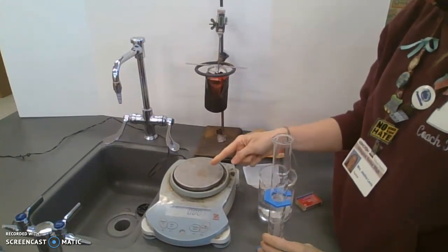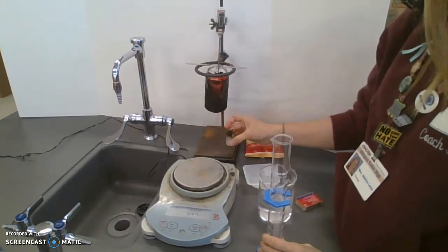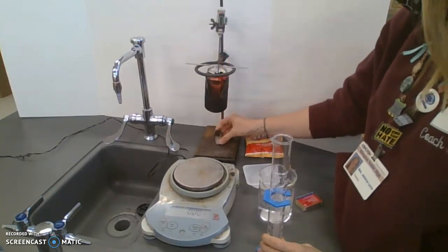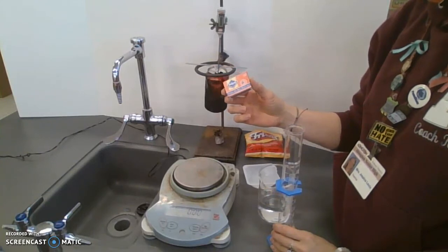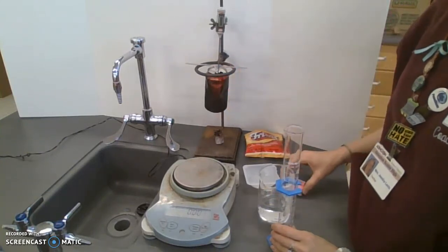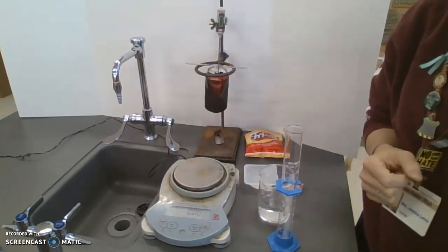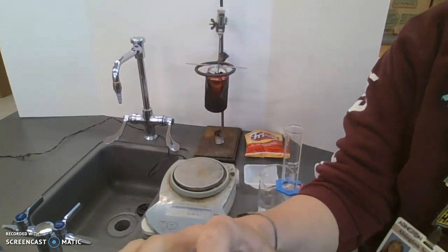A digital scale, a little stage to burn the food on, and some matches. So stay tuned and we will go over how we do our experiment.